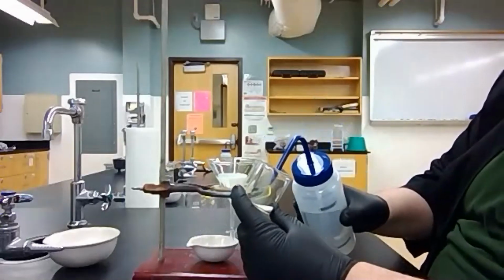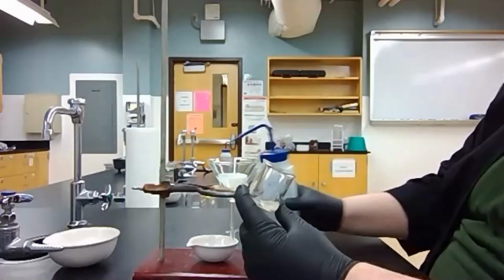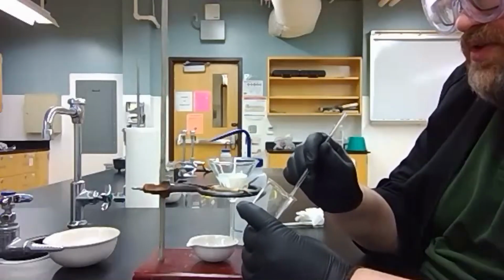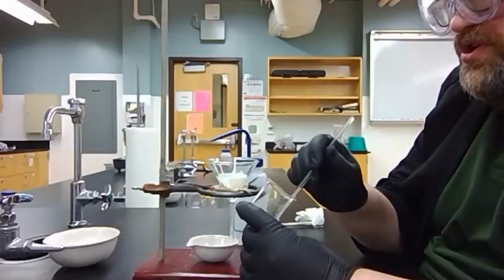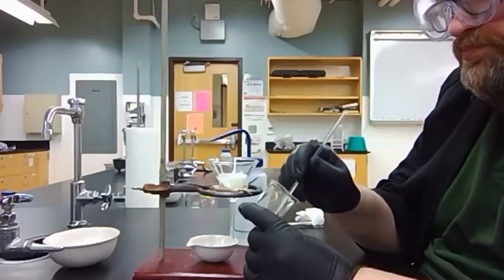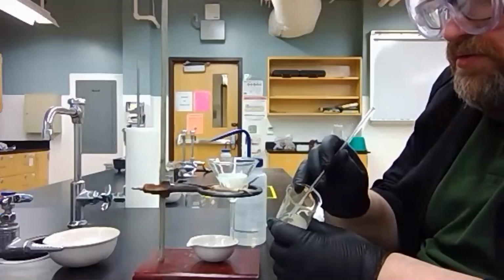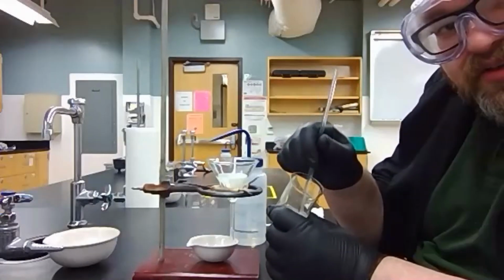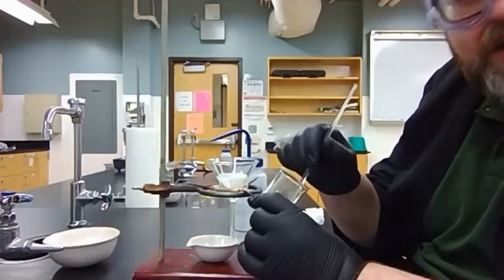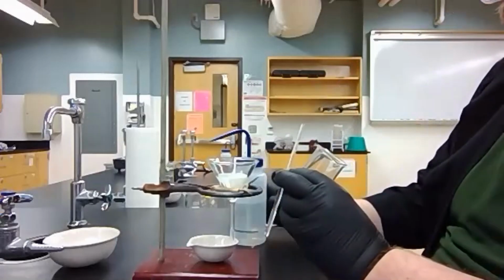So what I'm going to do is use small amounts of DI water just from my normal DI water container. And as I'm doing that, I'm going to use a stir rod to mix the two substances, or the three substances actually, together. Now, this water looks really, really cloudy. So that tells me that my sodium chloride has not all dissolved, because I should get a nice, pretty, clear, colorless solution. So that means I need to add a little bit more water.